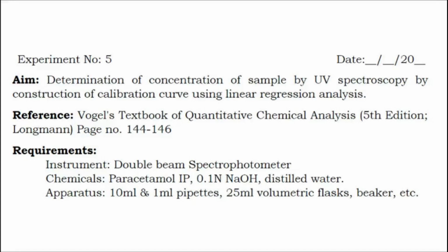Nilesh is telling it rightly, calibration curve. Okay, difference spectroscopy, it is used for multi-component assay generally, or where the excipients are problematic. Okay, anyway, difference spectroscopy is not wrong answer, but more correct answer is calibration curve. Okay, so in calibration curve, we have performed I think 2 or 3 experiments before using calibration curve using colorimetry.